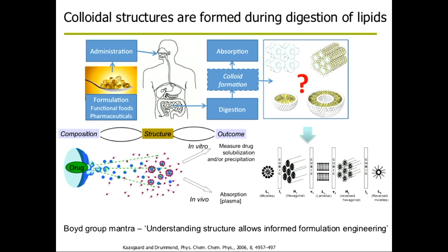If you disperse those to form particles, then they'll actually retain the internal structure of those more complex geometry systems. So my group in particular is really interested in these materials and controlling the structure of these to do things in drug delivery. We've got an interest in digestion and what happens during digestion to the structure of lipid particles, and I'll show you some interesting things on that front.